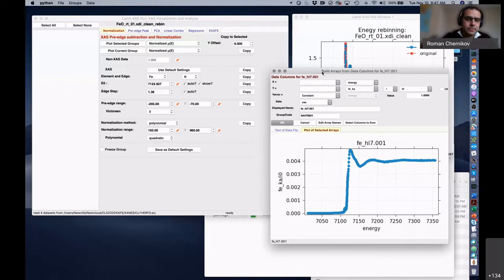I guess I would want to look at the details of that. Generally, there are a couple of different things that could be happening. Transmission XAS data is remarkably challenging to get excellent data on, unless you have a very uniform sample. If it's a liquid, it works, and if it's a metal foil, it works. And if it's a high quality nanoparticle system that is smooth, it can work well. But for anything else, for powder samples where the grain size is tens or 50 microns, and you're trying to make a uniform sample that's 10 microns thick, it's actually pretty challenging.